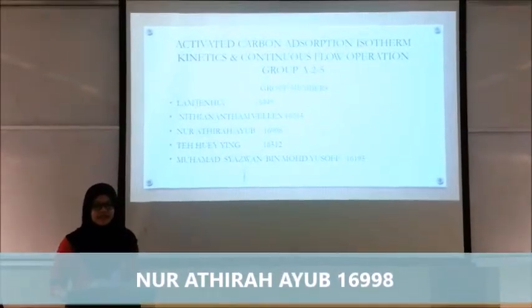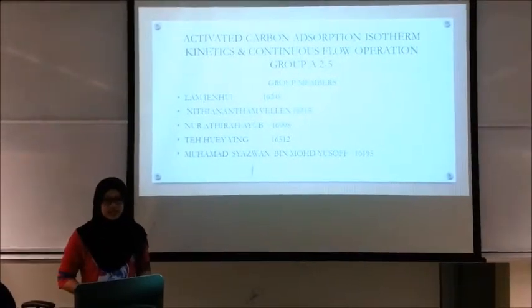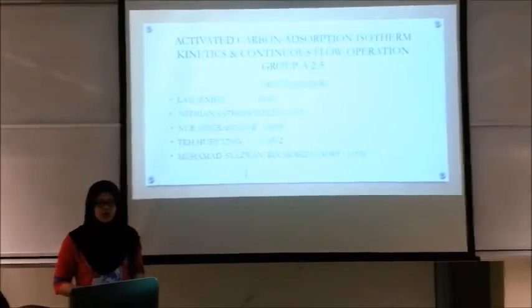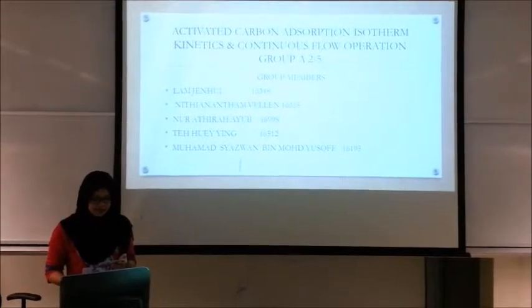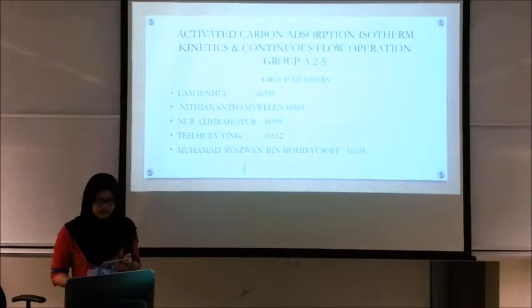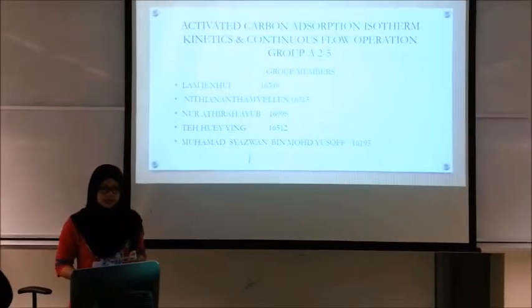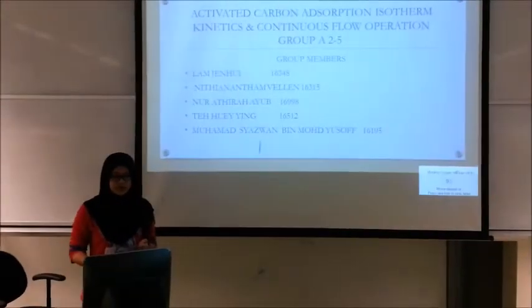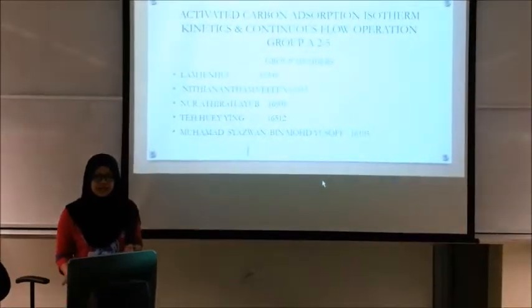My name is Atira and I'm from group A25, and our group will be presenting on activated carbon adsorption, isotherm, kinetics and continuous flow operation. We did the experiment through sets of instructions which can be found in the methodology section by using the appropriate apparatuses. We determine the values for absorbance by using a spectrophotometer. From the absorbance obtained, the concentration values can be determined from the calibration curve for methylene blue in the appendix.